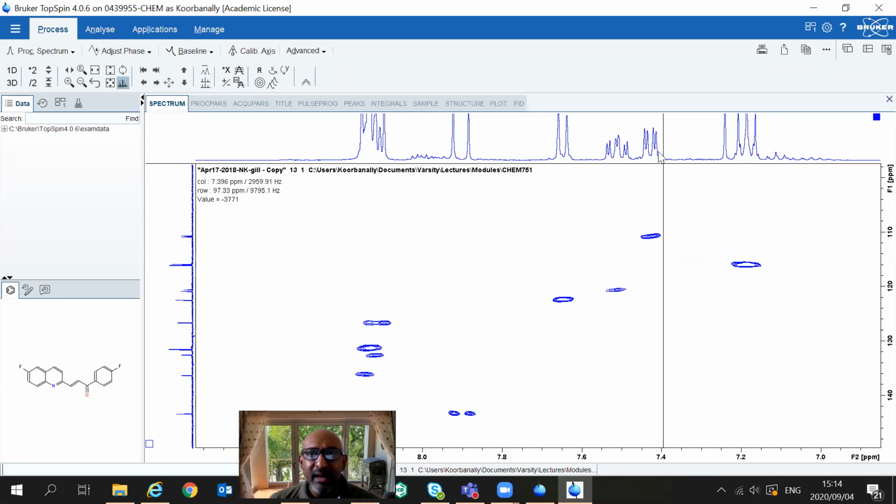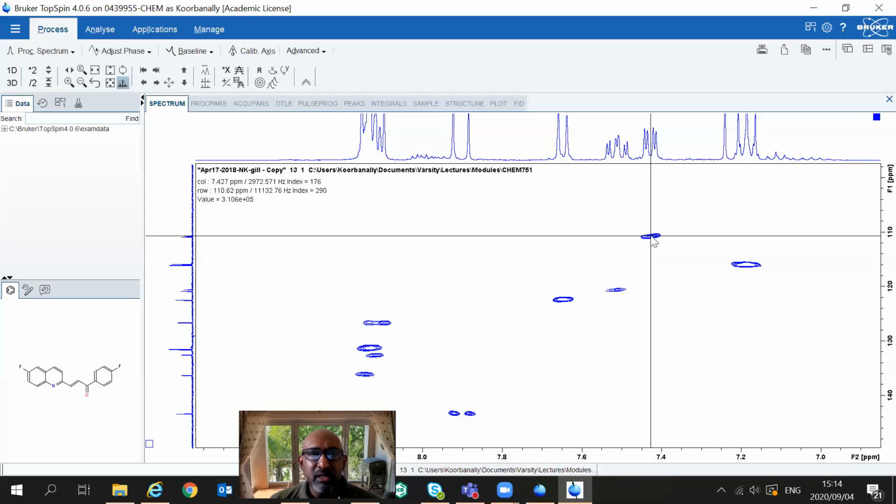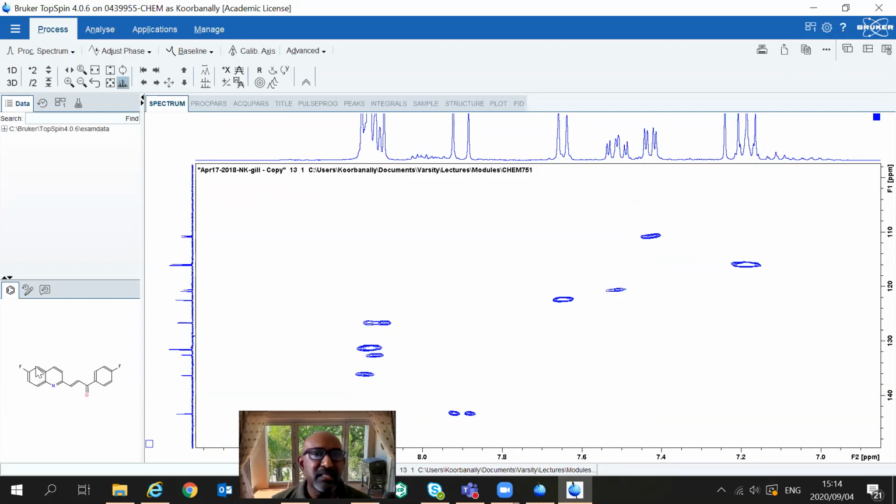But today I can know exactly that this particular carbon being correlated to this particular proton resonance with that splitting pattern is unequivocally this carbon atom here. So I can immediately identify this carbon atom just by what I did today with the coupling constants. So that correlates to that, and that's these 2 carbons here. That correlates to the proton there and the carbon on there.